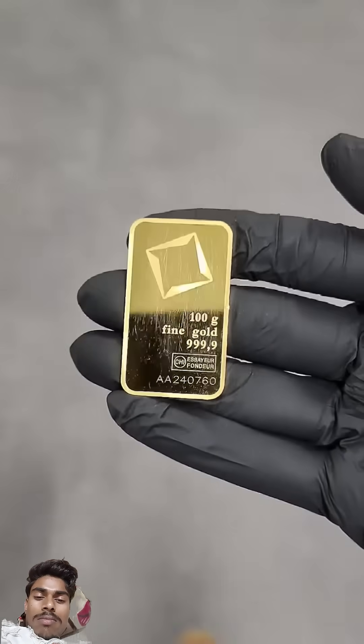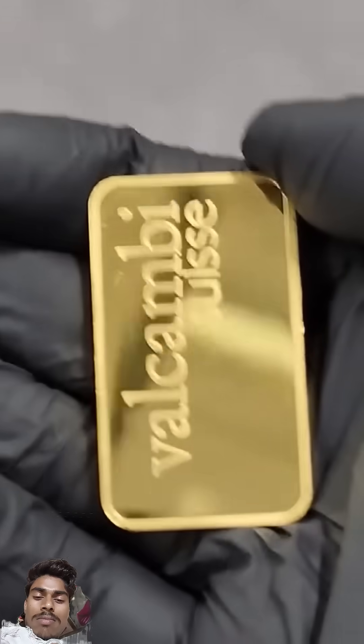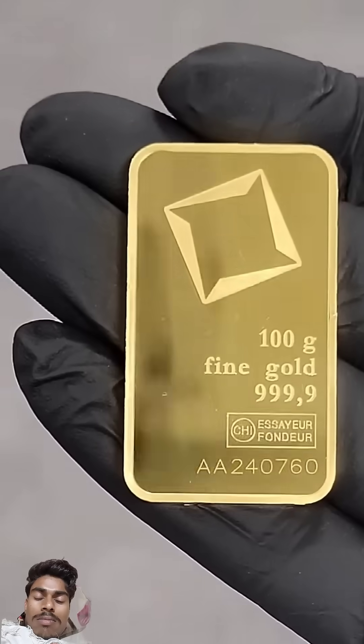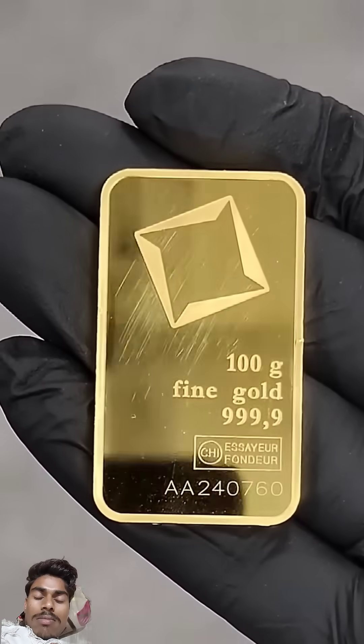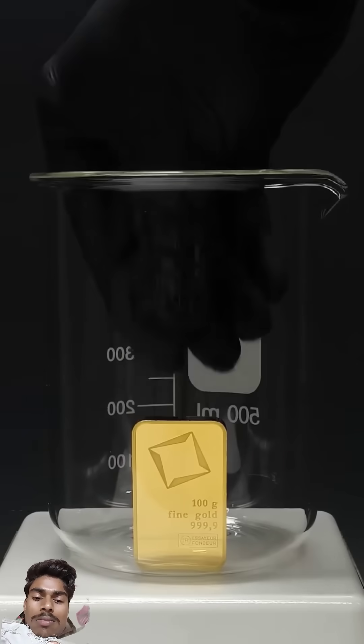What I have here is a hundred grams of pure gold at around $57 US per gram — it's worth about $5,700 and it's one of the most expensive and precious things that I own. But anyway, I think I'm just gonna destroy it using acid.